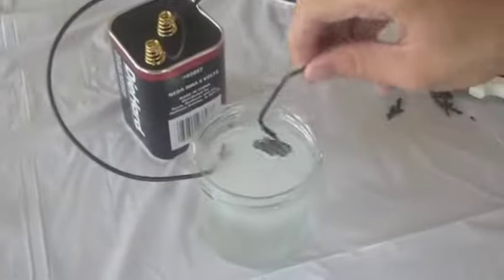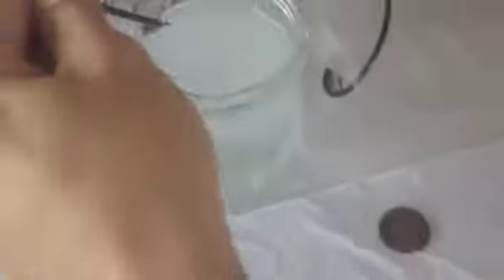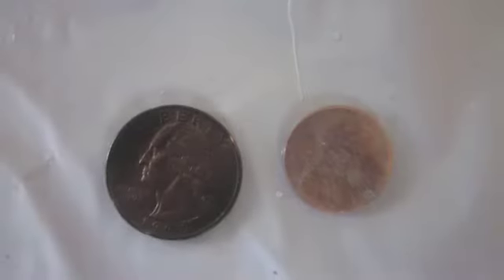After about five or six minutes, we took out the quarter and we were happy to see it developed a nice shiny copper sheen to it. And while we were happy with our first result, like great scientists, we decided to do it again.